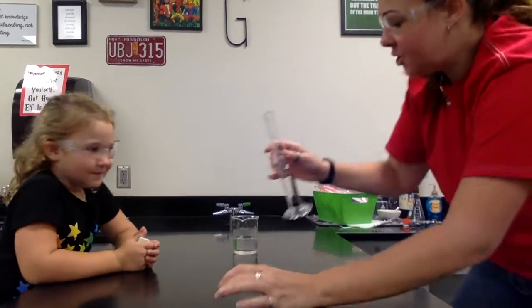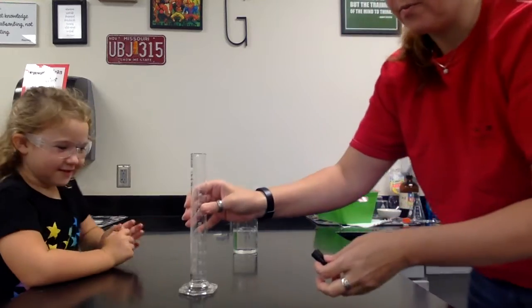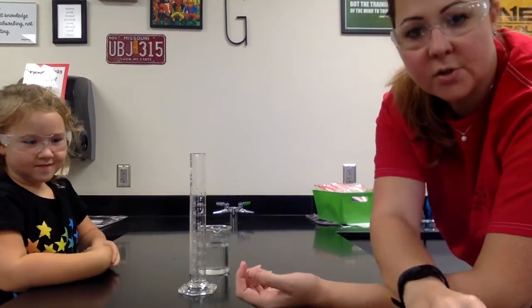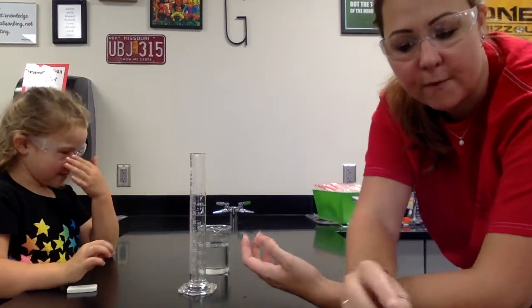So then all we're going to do is pour the water back in the beaker. And then this is a beaker. Oh, can I put... No, that's a regular shaped object. It doesn't go in there. And then we would do the same thing with our next object. We would put the water in, put it in there, and then go from there.